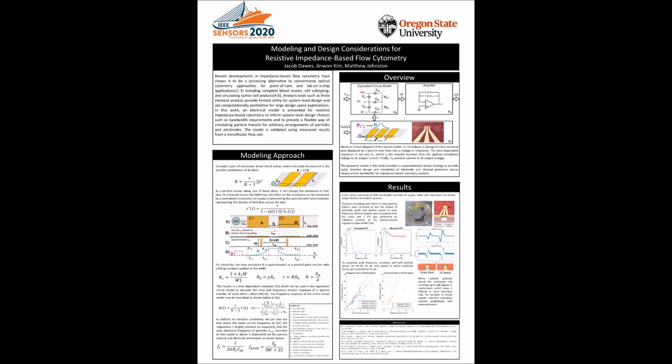To test this idea, we built a test wafer with SU8 microfluidic channels on glass. As expected, the peak frequency does correlate well with particle speed, and for some sizes, it seems to follow pretty well with the trend that we predicted. Additionally, when we try to simulate multiple particles transiting the electrode simultaneously, it matches pretty well with observed phenomenon.